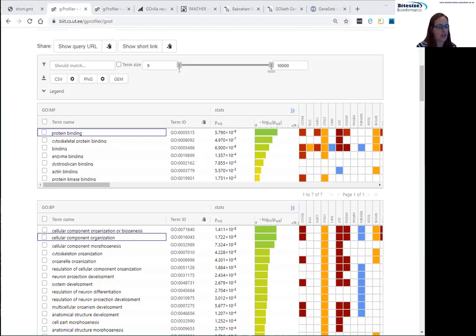So we generated sets of genes biased by GC content, so low GC genes and high GC, and genes biased by length, so short genes and long genes. It's still for mouse at the moment. We've done this for mouse and for human. And also sets of genes where there were a high number of transcripts or splice variants annotated in the genome. Genes that were closest to randomly generated positions in the genome. And we've also tried taking genes from just one chromosome.